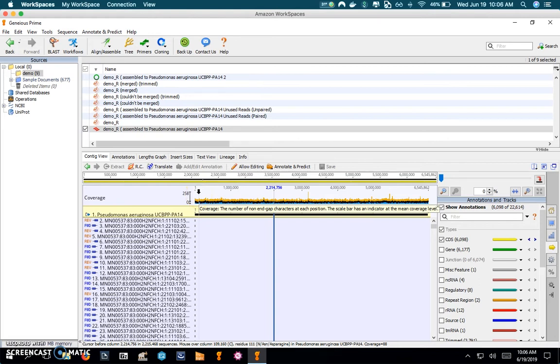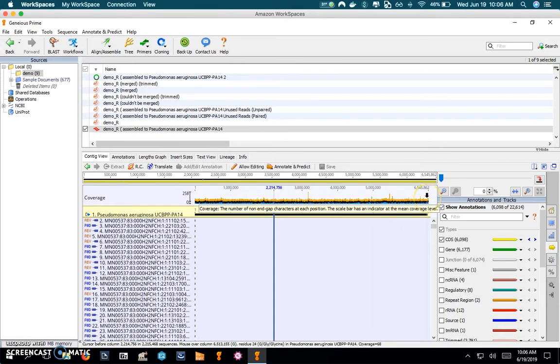If you look across the alignment of the reads against the reference genome, it shows that the coverage is quite uniform all the way across, and that's really important. We like to see uniform coverage across the entire genome.